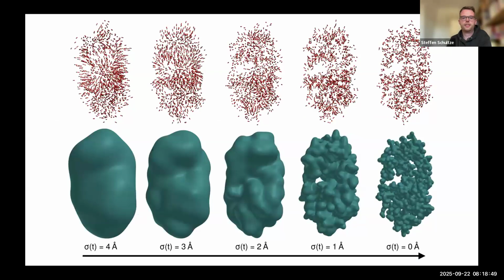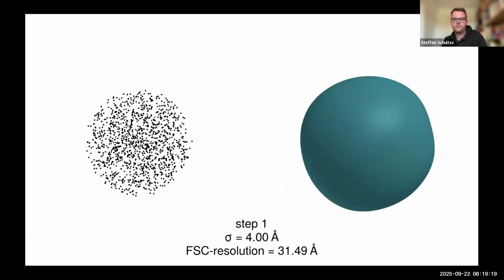And so what this looks like in practice is that we have a time-dependent smoothing parameter, which we let go to 0. In the top row, you can see the actual atomistic positions here. The red arrows are the current gradient, and you can see how the gradient is really smoothed by this. This allows us, in the beginning, to make very large-scale updates, and then as this smoothing parameter decreases to 0, more and more fine-grained updates. So I hope this works over Zoom.